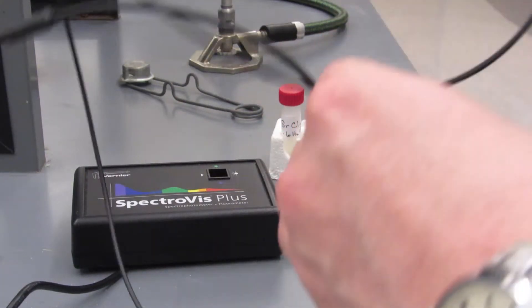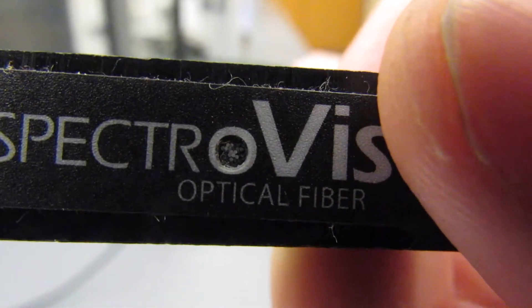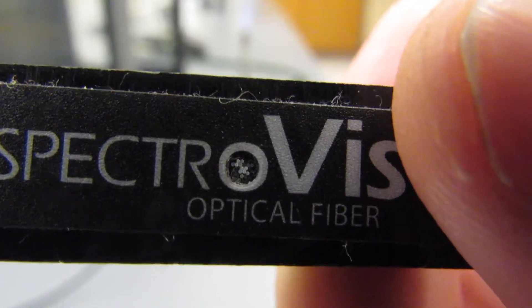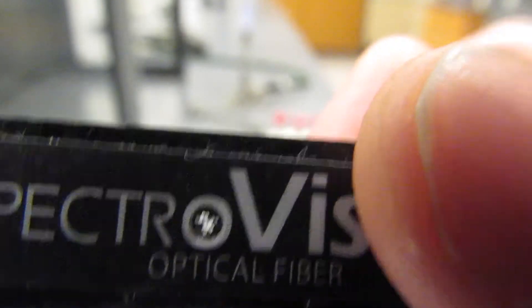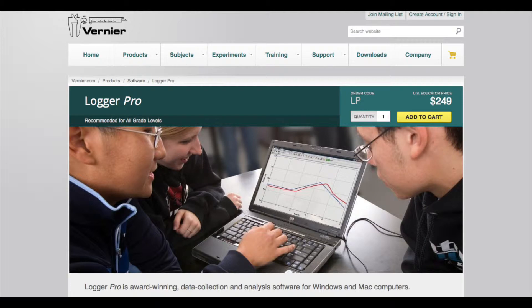A fiber optic cable will be pointed at the flame. The color is then transmitted to the cell, which is then read by the spectrophotometer. The spectrophotometer is plugged in via USB to a computer. The software we use to analyze all the data is called Logger Pro, which is also made by Vernier.